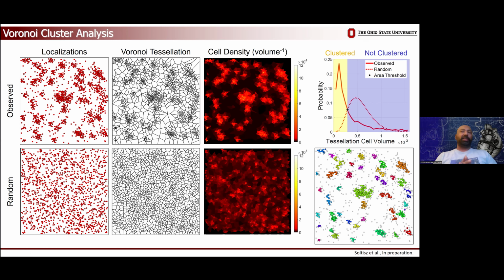But then the question is, at what density do we consider this to be true non-random clustering? If you just drop a bunch of coins on the floor, some of them will end up next to each other. Doesn't mean they're attracted or there's some kind of process happening. That's just random chance. We want to be able to measure and exclude that. So traditionally, the way to do that would be you randomize your points, repeat this process a whole bunch of times, burn a bunch of computer time, and then eventually get to this random distribution.